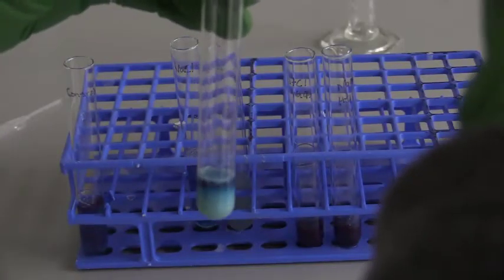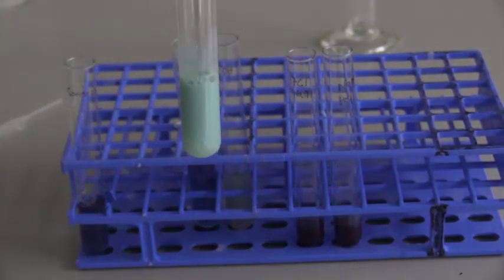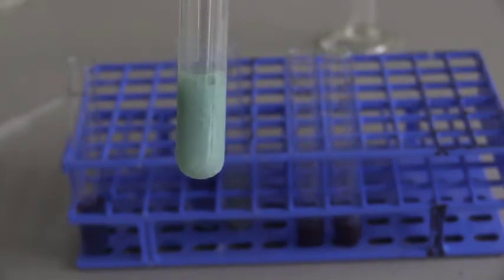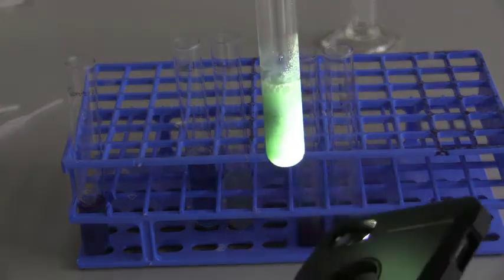This next sample is getting lead nitrate. So you can see what's happening in that tube. Alright, was there still activity when light was shined on it?